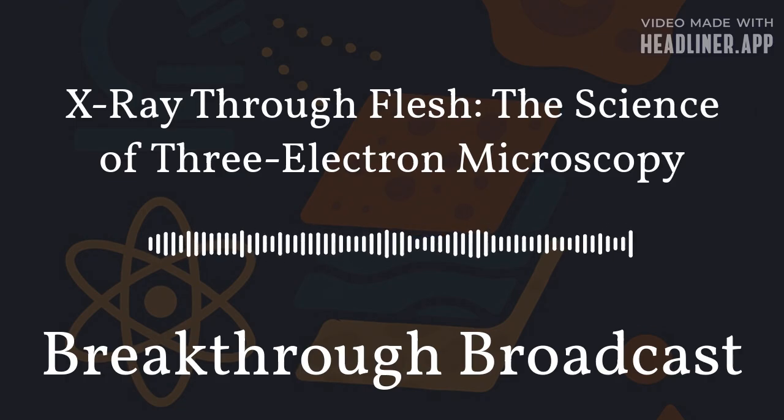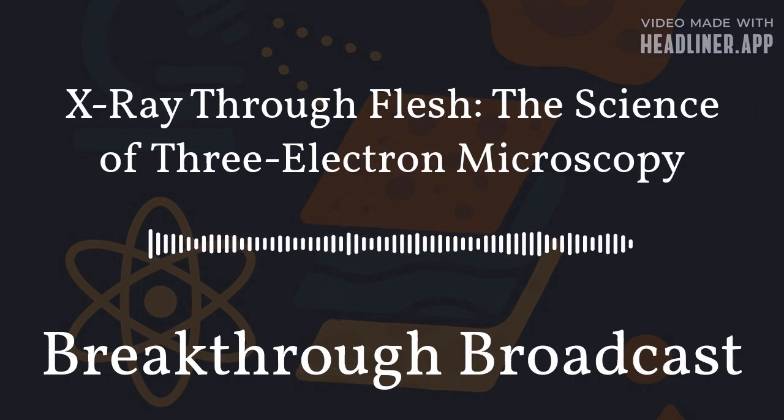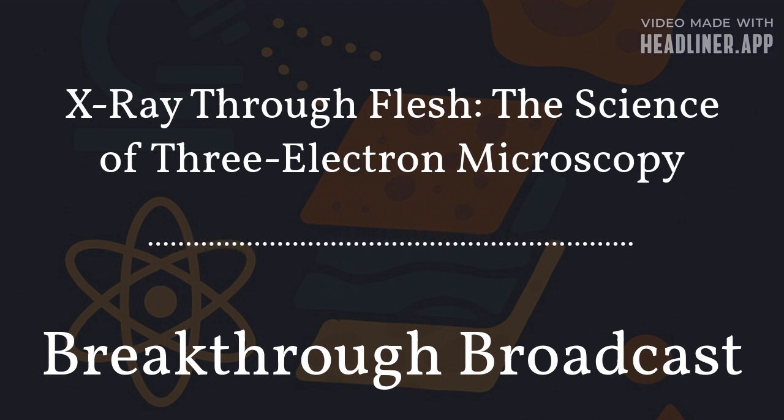Even systems that combine two electron signals tend to leave ambiguities, because two viewpoints cannot fully clarify spatial relationships within complex tissue. The addition of transmitted electrons allows the microscope to represent both surface and internal features without heavy sectioning, without forcing scientists to infer missing details.